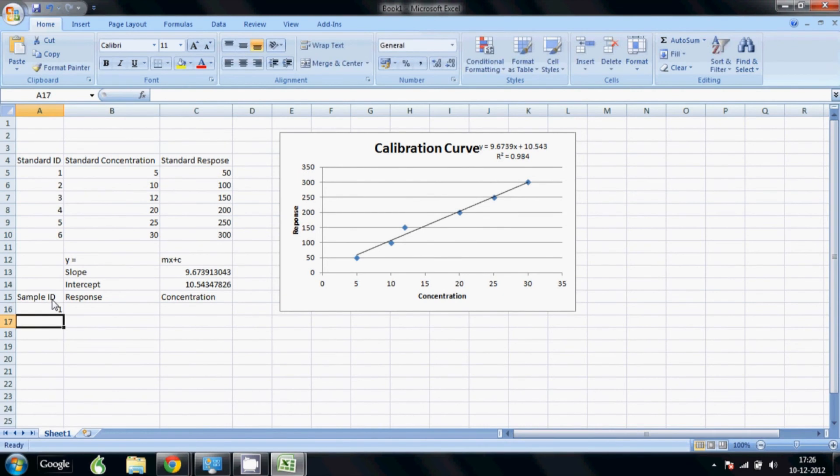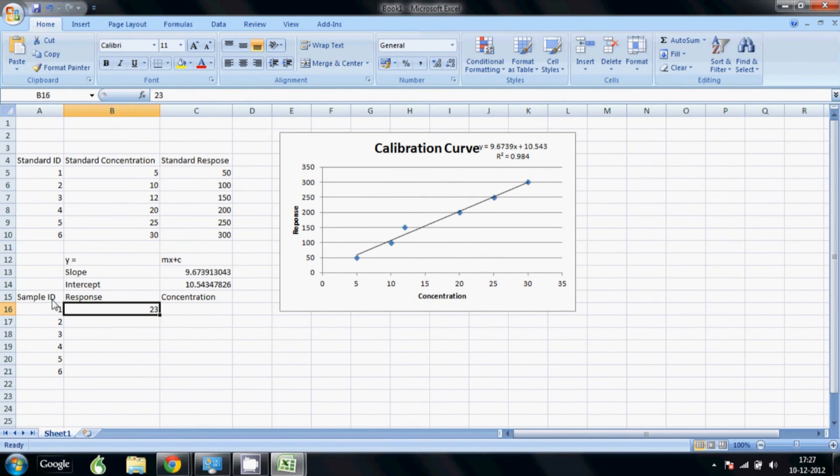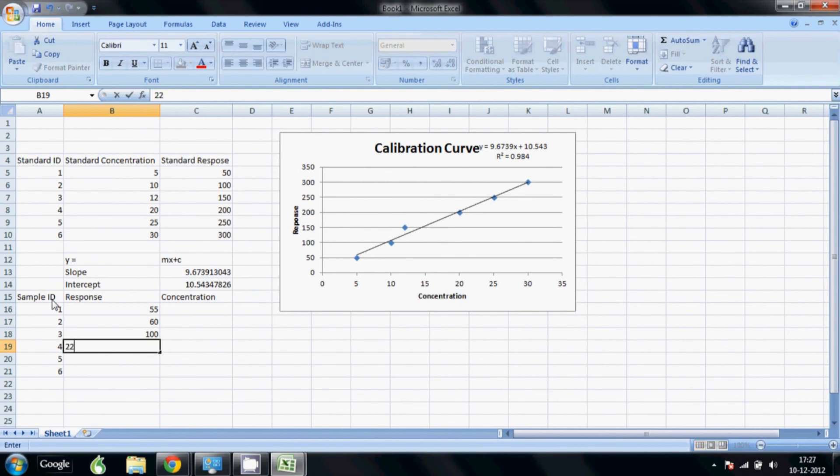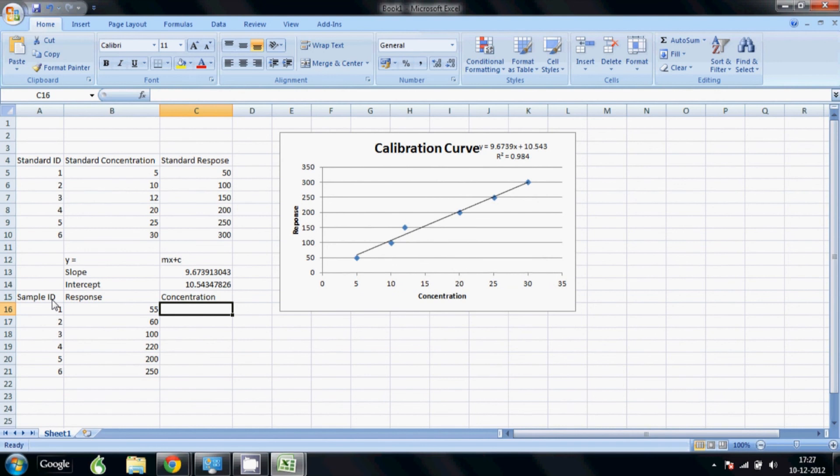And we will arbitrarily put some area for the response. Say 55, 60, 100, 220, 200, 250. All right, so now we need to put the formula.